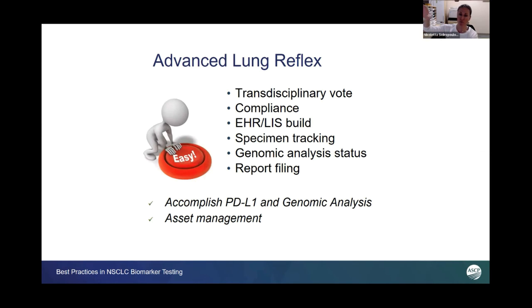And as we move through our processes in genomic medicine, we're able to update the system so that clinicians can basically see and they know when to anticipate a final result on a case. We also have built out the EHR so that we're no longer just plopping our reports into this scanned media section of the EHR. We actually have a place where they file and they're visible and it's labeled molecular pathology, and that was a huge win.